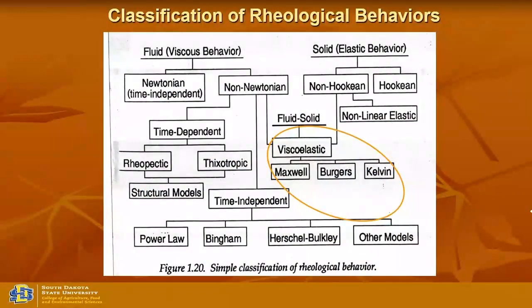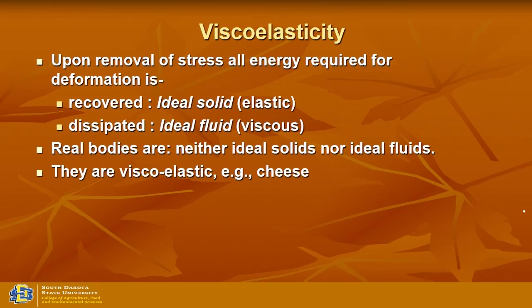Now I'd like to direct our attention again to viscoelastic properties, but in a different approach, not as a compression test, but more of an oscillatory shear measurement. If you remove the stress, all energy required for deformation is recovered if it is an ideal solid, right?